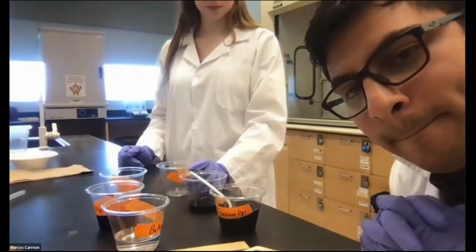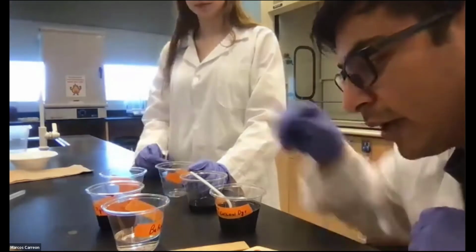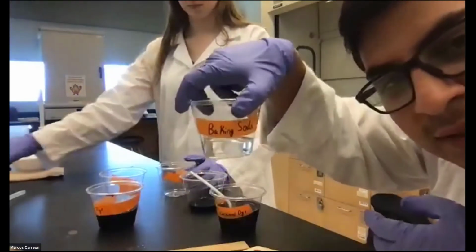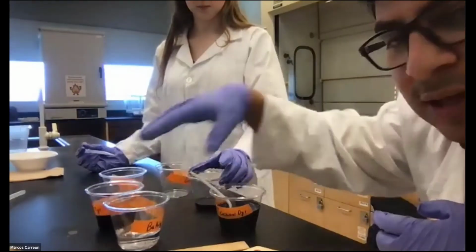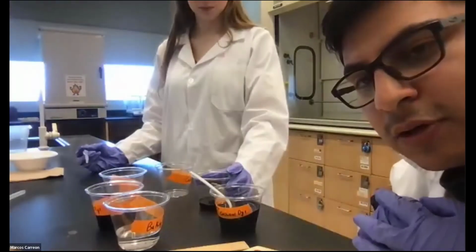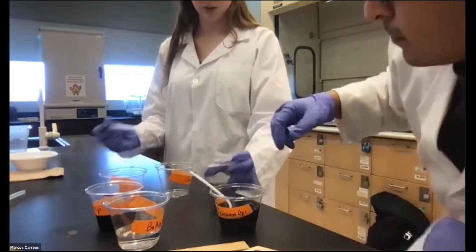Next step, we're gonna go ahead and make our acid. I'll let you guys think about that. So right here we added our basic solution. So if we add the acid solution, should it be darker or brighter? We'll see what happens.